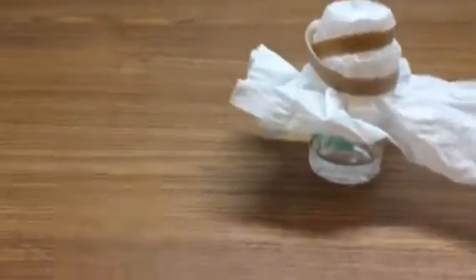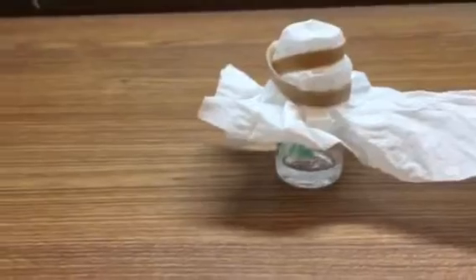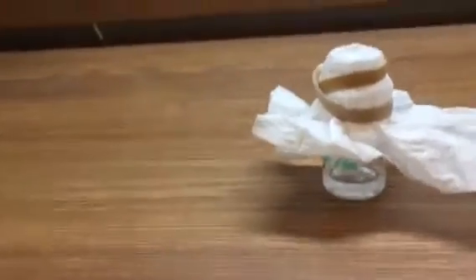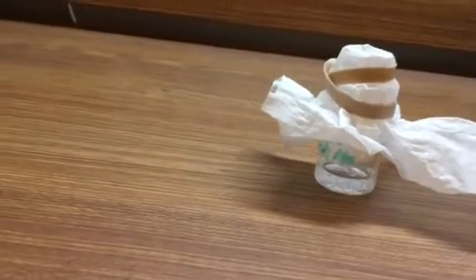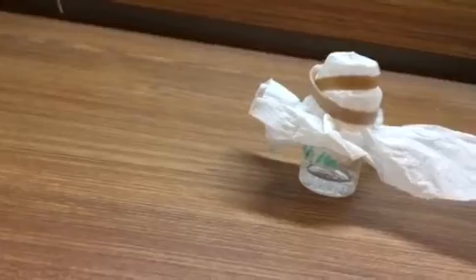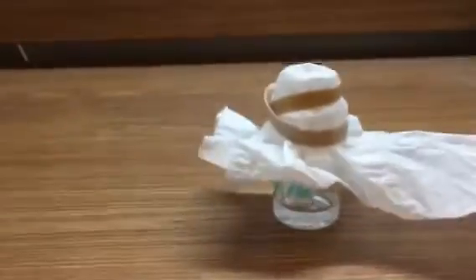And a way to grow one really large crystal would be to first let the saturated solution sit for a week or so. Once you have some crystals growing, then pull out and separate the largest crystal and isolate that largest crystal in the saturated solution. So it's the only crystal that is taking the effect of the saturated solution, and it will grow larger and bigger. And is that happening right now?